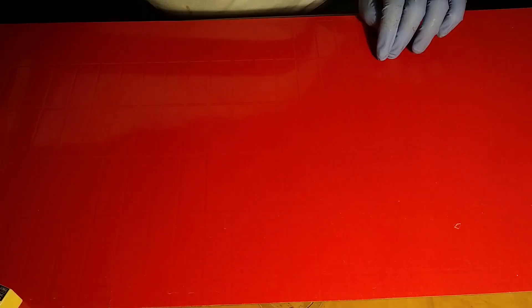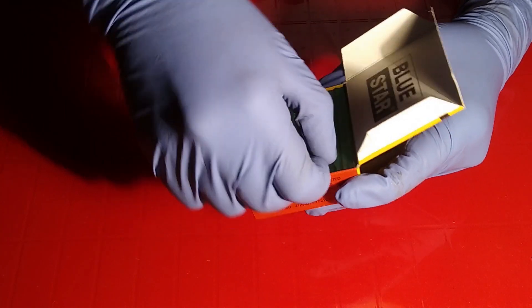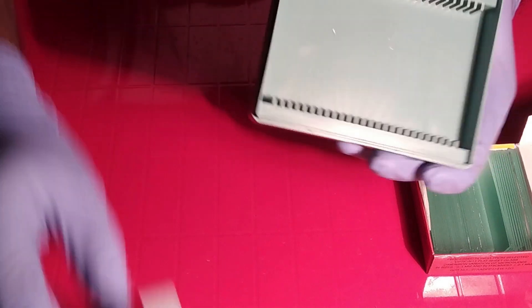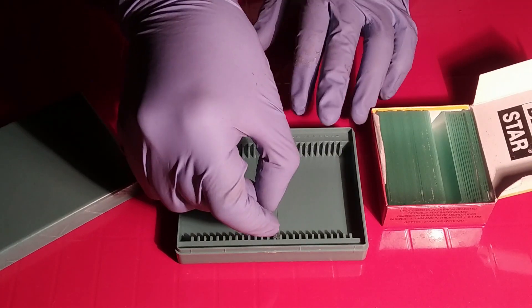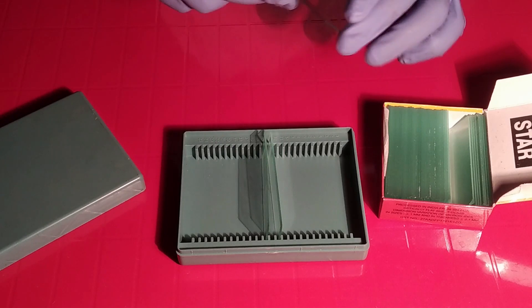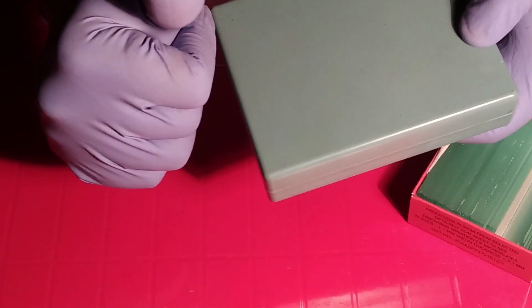To carry slides you need a blank slide box like this one, and you have to arrange slides in it. After completing your staining or any tissue section slides, you can keep them stored safely in this box.